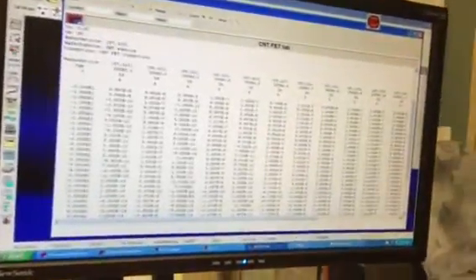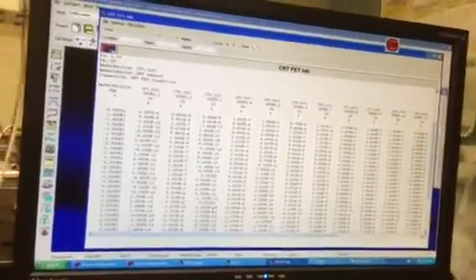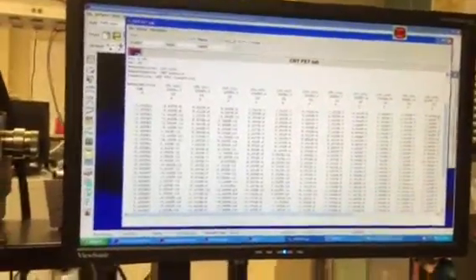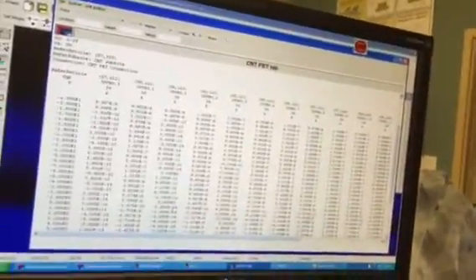Or even if you're me, you'll forget what you did the last time. This way, it's there. You don't have to remember how to do this report, especially if you don't do them as often.